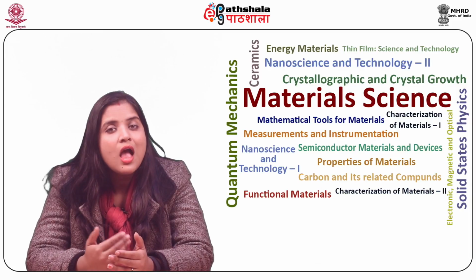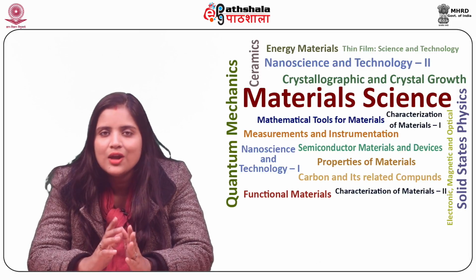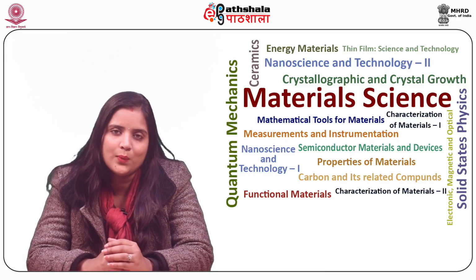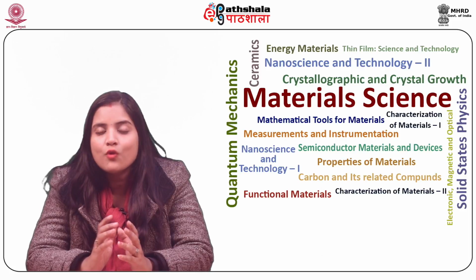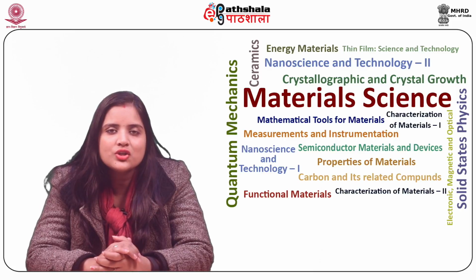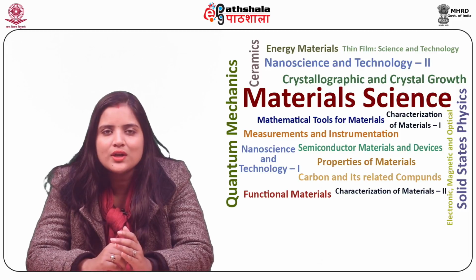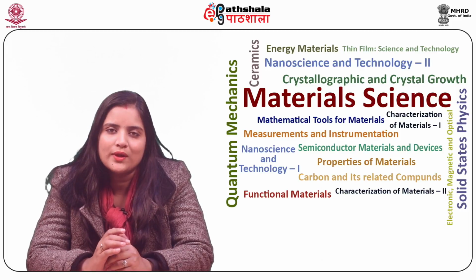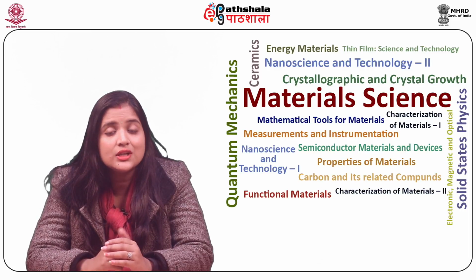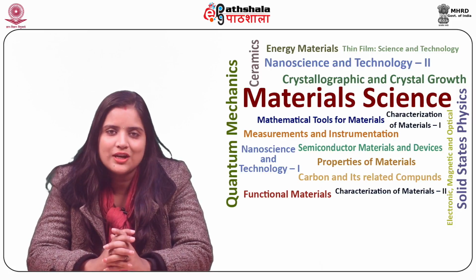The crystal as well as the detector is mechanically rotated to record the X-ray spectra as a function of wavelength. In the case of focusing geometries, the distance between source and crystal is proportional to sine theta and consequently proportional to the wavelength. Thus, the crystal is simultaneously rotated and moved along a straight line via a mechanical connection.